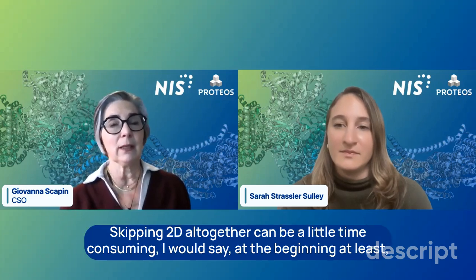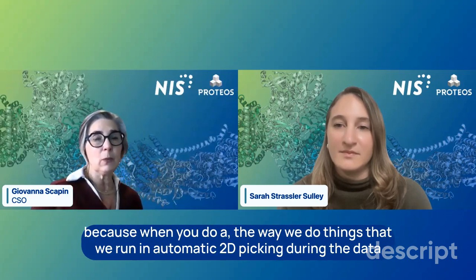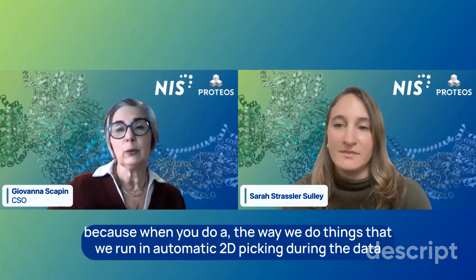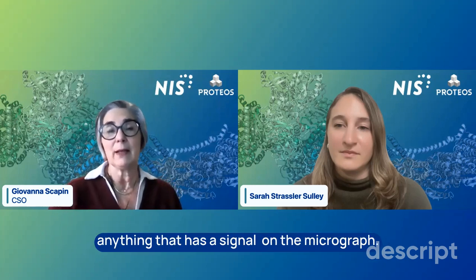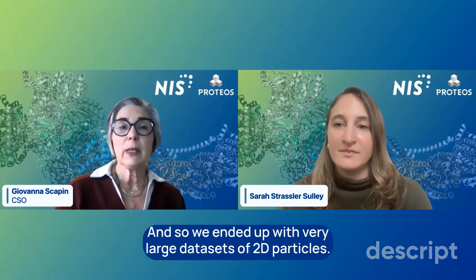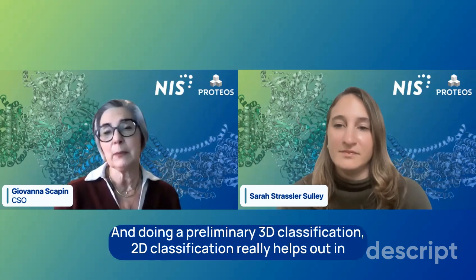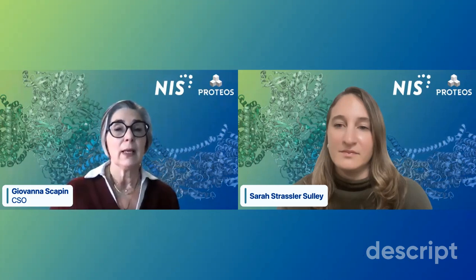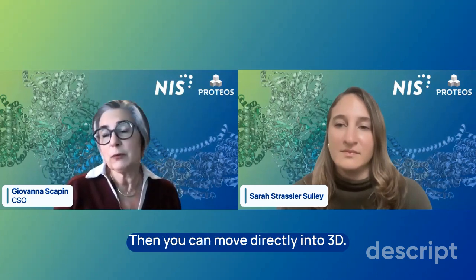Skipping 2D altogether can be a little time-consuming, I would say, at the beginning at least, because the way we do things, we run automatic picking during the data collection, and we usually use very loose parameters so that we are almost sure that we pick anything that has a signal on the micrograph. And so we end up with very large data sets of particles, and doing a preliminary 2D classification really helps in cleaning up and discarding all the junk particles that you have in there. Then you can move directly into 3D.